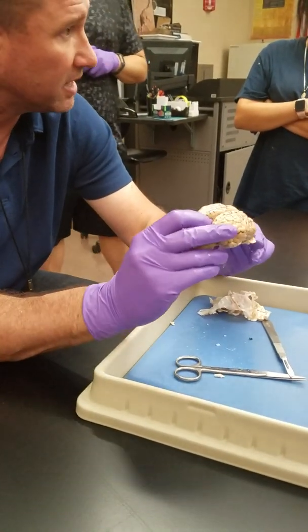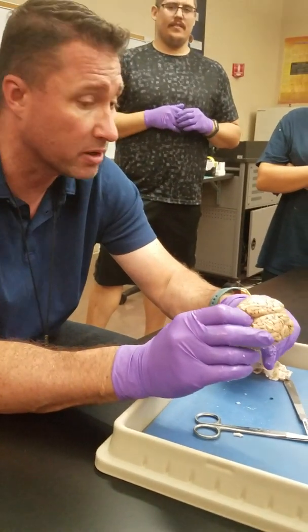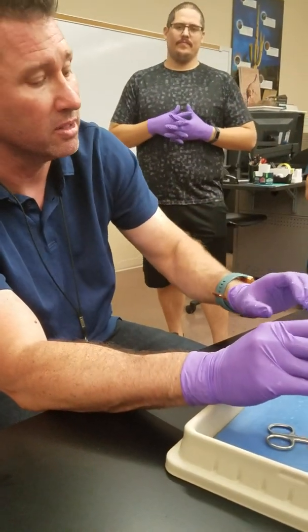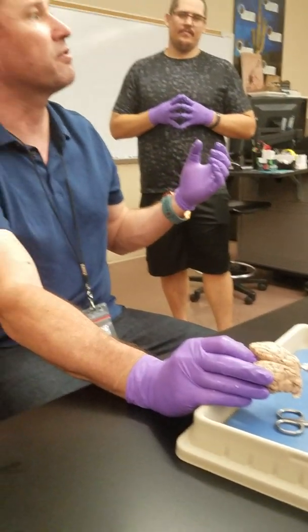So the brain is free floating in the skull, at least for humans. Other brains aren't free floating, like for example, bighorn sheep. A bighorn sheep's brain is directly attached to the skull, doesn't move at all. So bighorn sheep can bash their heads together. Our brains are free floating.